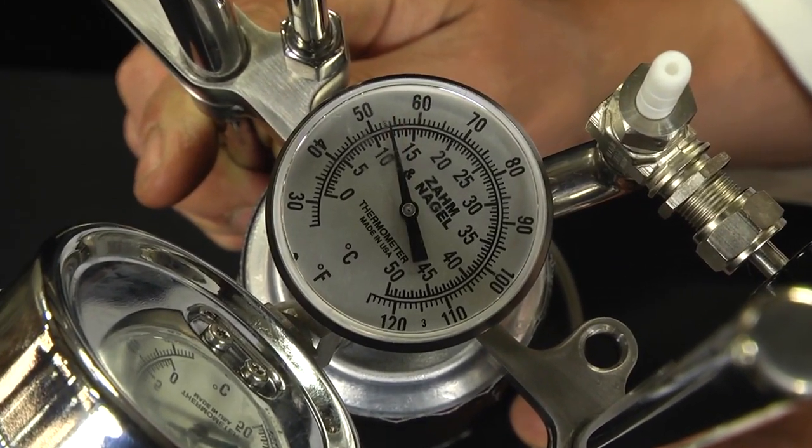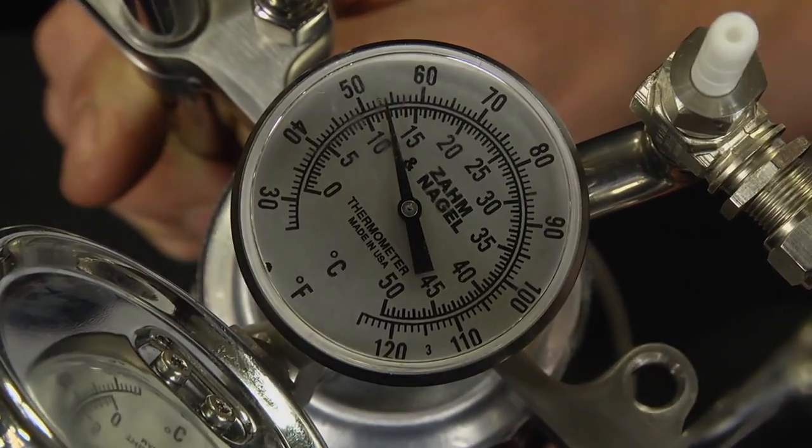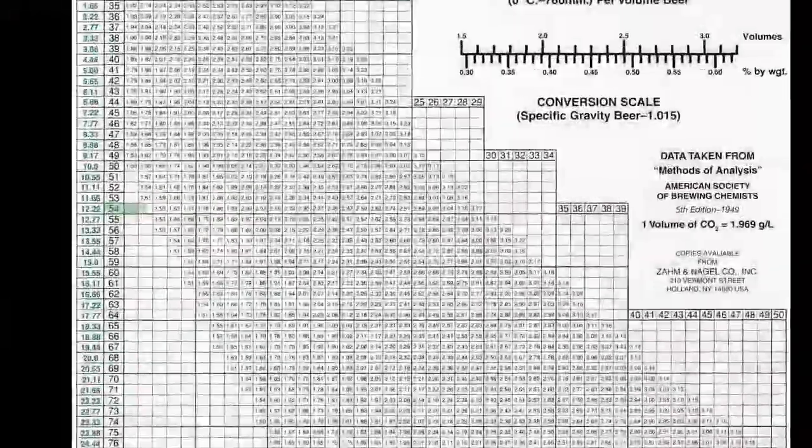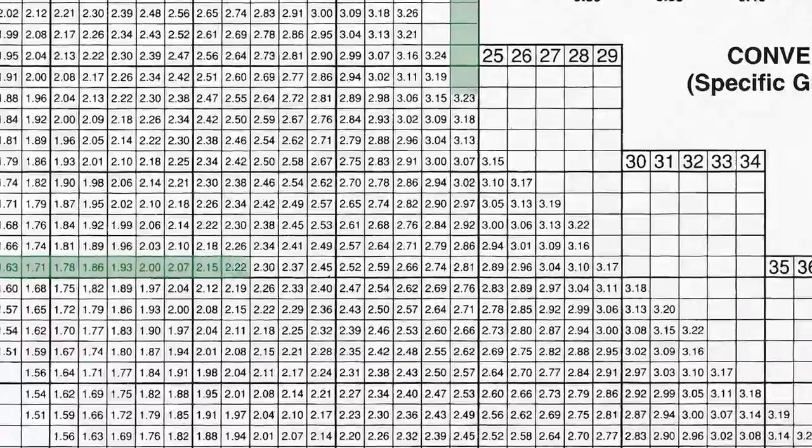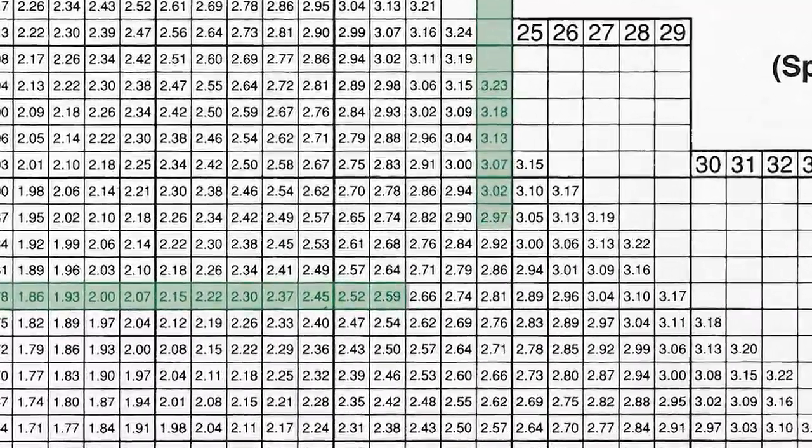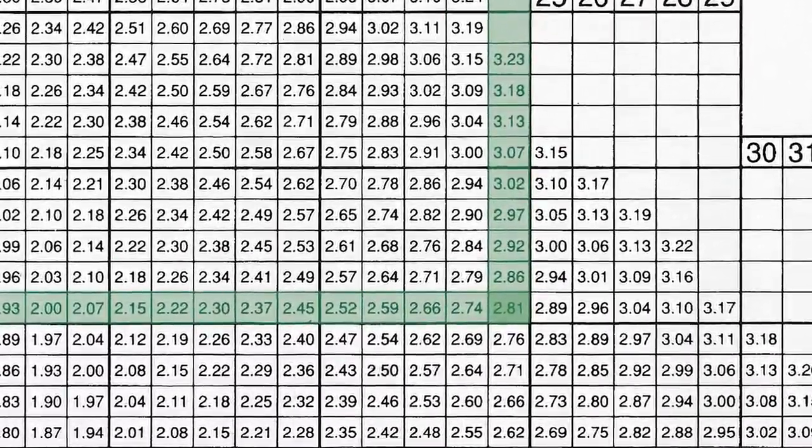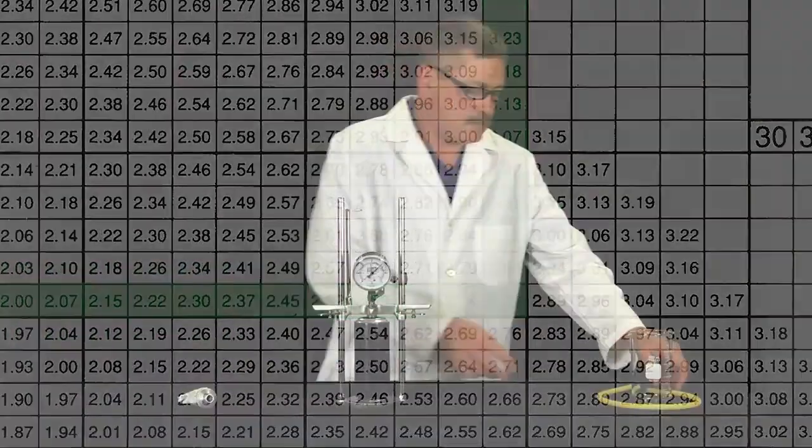Caution! Do not record the pressure at this point as there will be a false reading. With the pressure and temperature recorded, refer to the correct relationship chart to determine the volume of CO2 gas. Charts are available for both alcoholic and non-alcoholic beverages.